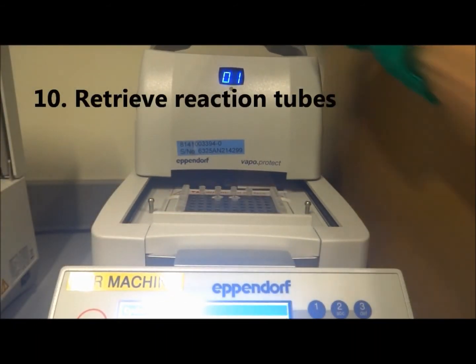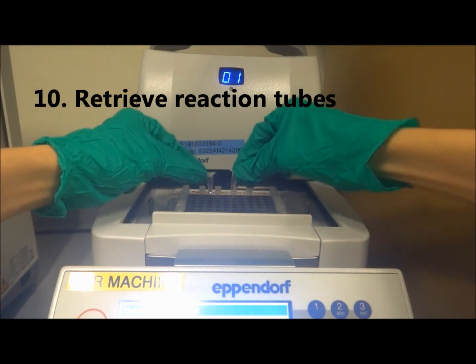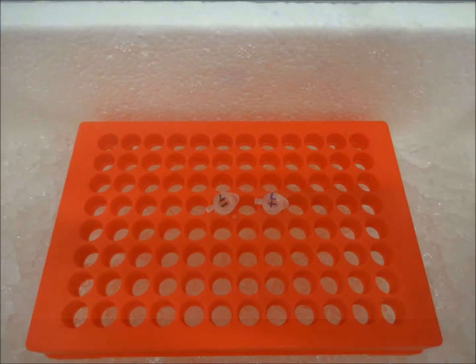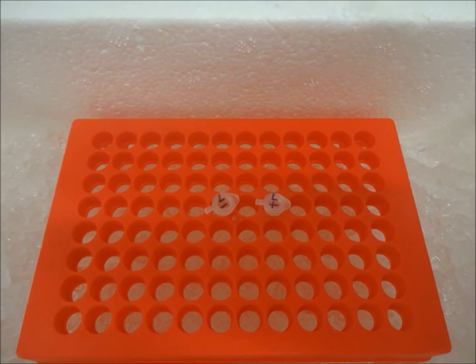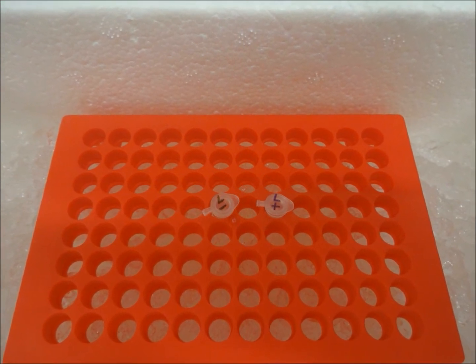After the reaction is completed, retrieve your tubes. The ligation product is now ready for further experiments. Store the tubes in the minus 20 degrees freezer if you are not using them straight away.